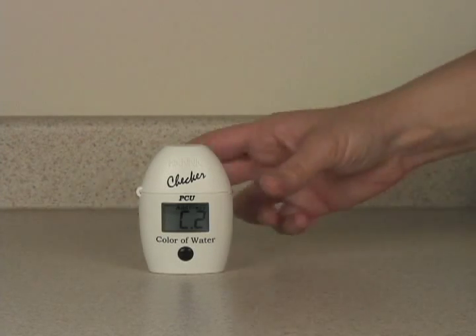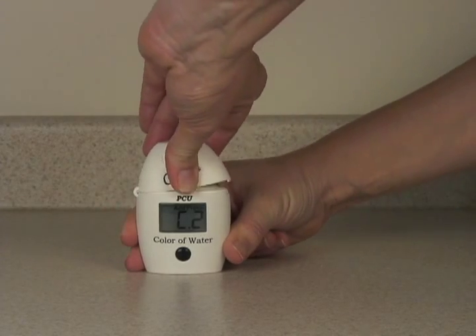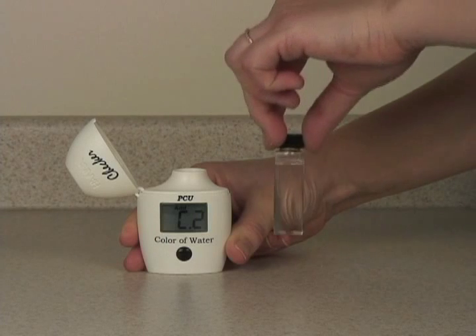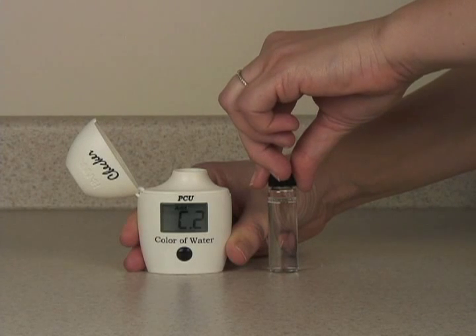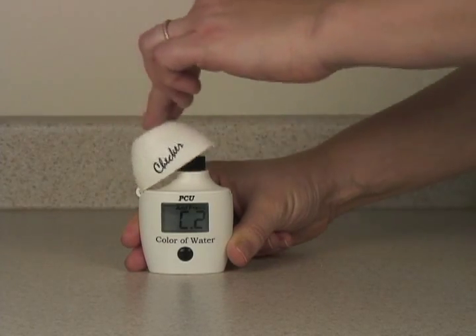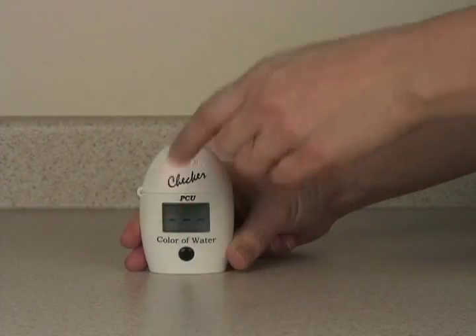When the meter says C2, you're ready to measure the apparent color. Remove your blank and fill the next cuvette with 10 milliliters of your sample water. Put your sample in the checker and press the button again to take the measurement.